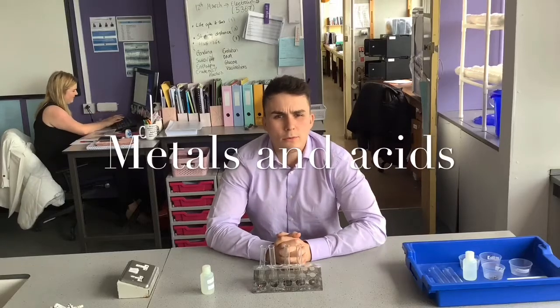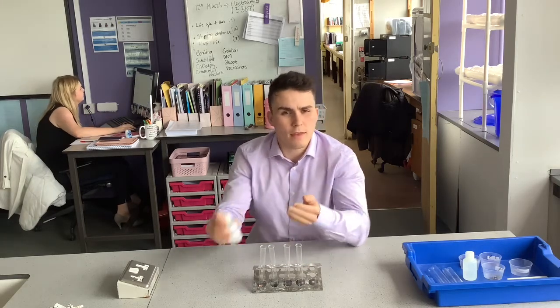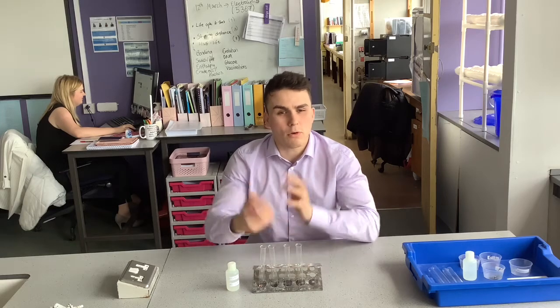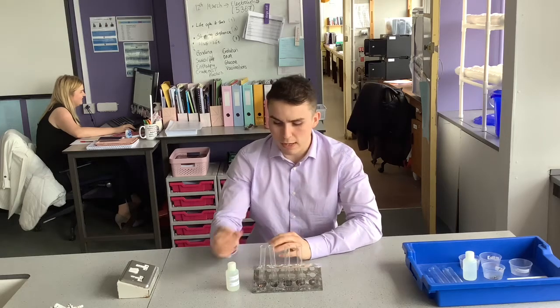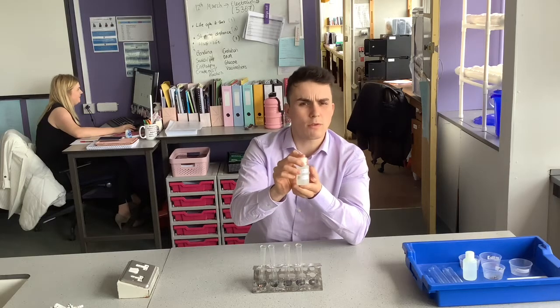Okay, good afternoon. We are back with another practical. We're going to be looking at the reaction of metals with strong acid. This is another way of looking at the reactivities of metals. If you're really interested in it, we've got a longer feature-length video where we talk about it in much more depth. But very quickly, hazard: strong acid is corrosive.